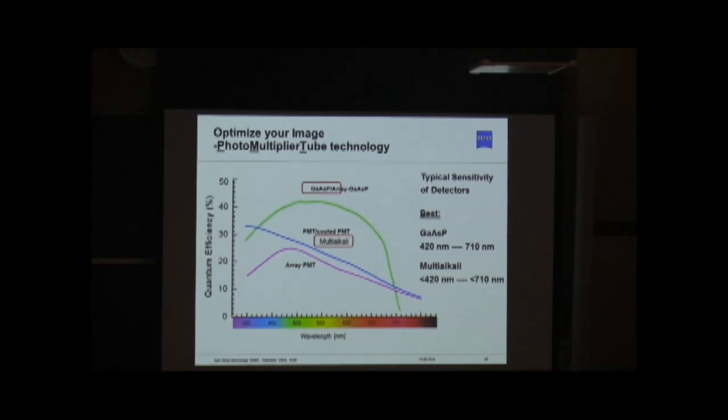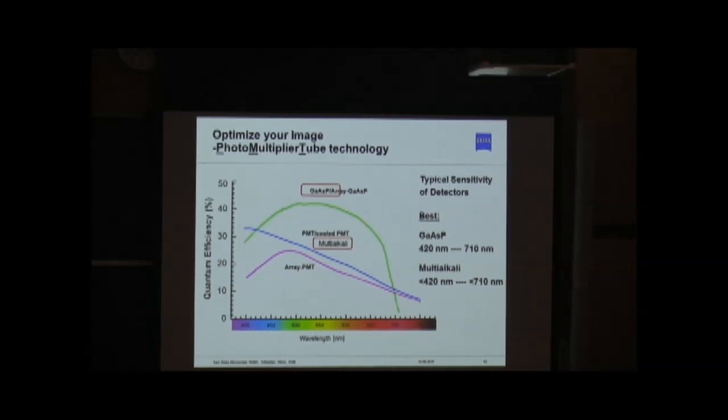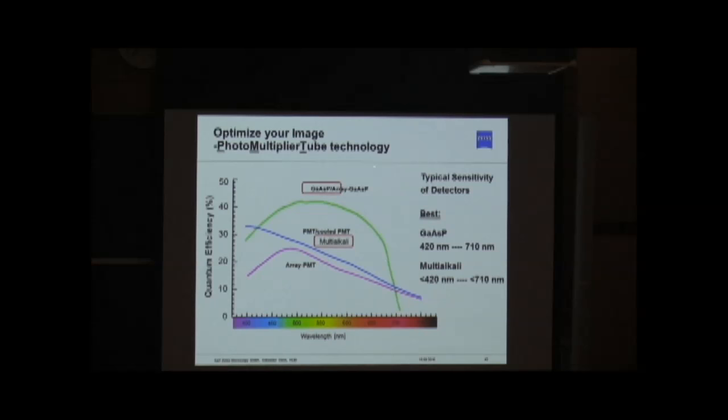By the way, from one detector generation to the next, if you go to a more recent confocal microscope system, for instance, a 710 to a 780 to an 880 system, this quantum efficiency is actually a major change. The technology provided by the big companies like Sony or Kodak has improved, and that's the reason for new detector surfaces, detectors which have a more recent photocathode surface. Okay, nonetheless, we have different wavelength sensitivities with two detectors.